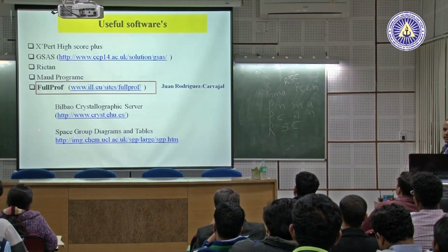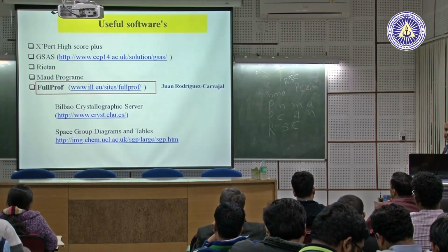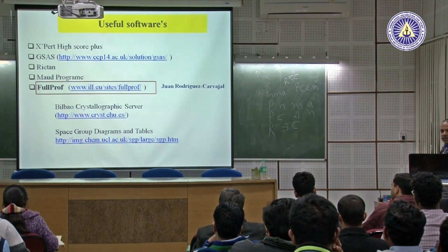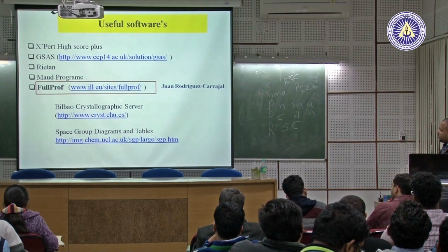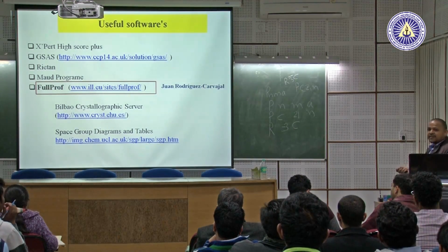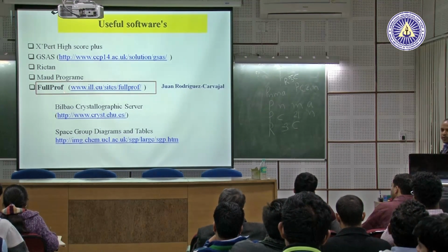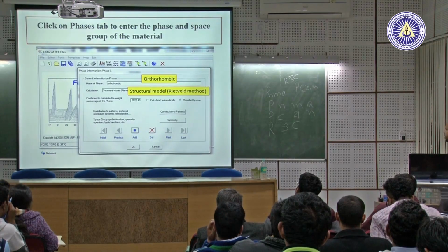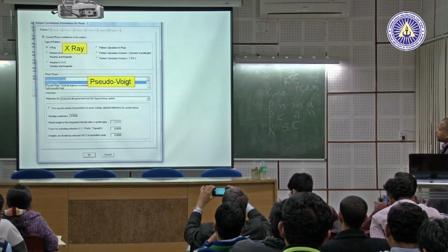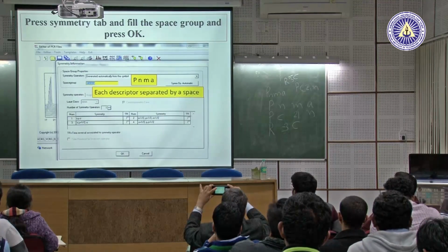It is very important, it has a lot of information. For Raman, for X-rays, for texture, for strain. Now I don't remember all, but it has a lot of information, and most scientists follow this server. Okay, I will be here. Then symmetry is here. Okay. Now you are ready for refinement.